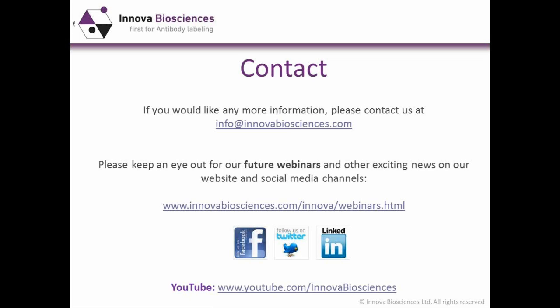Okay, thanks for that, Andy. So our second question is, do I need to use an FC blocking reagent when using human samples in the same way as with mouse samples?